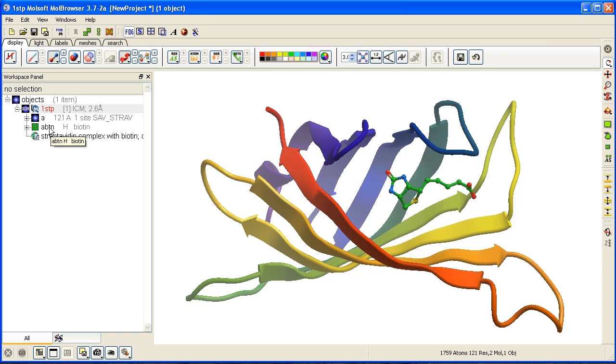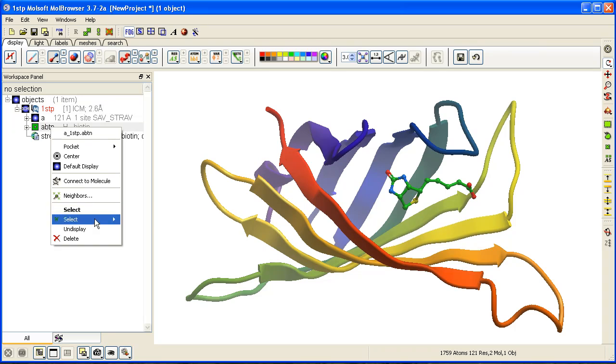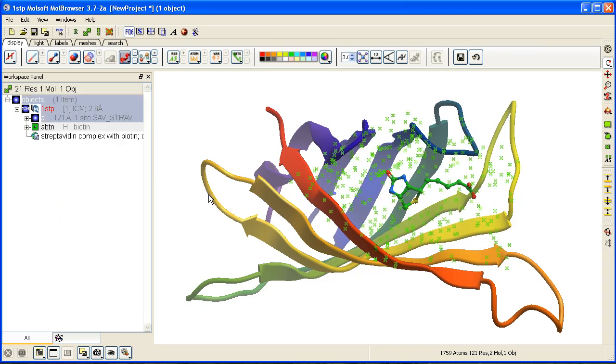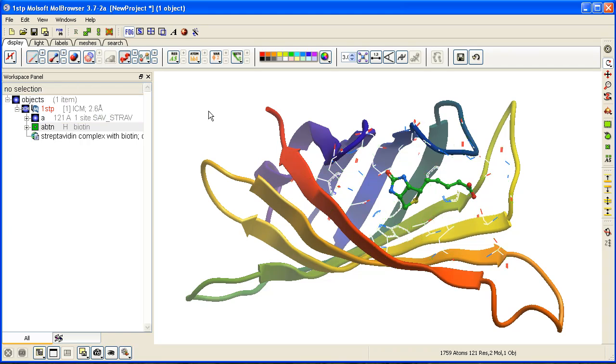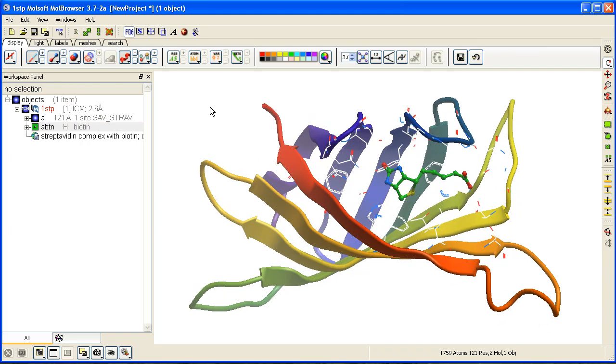We can right-click, select neighbors, and display them in wire.